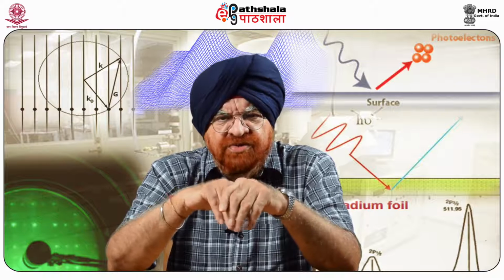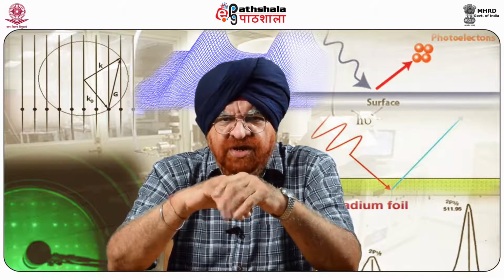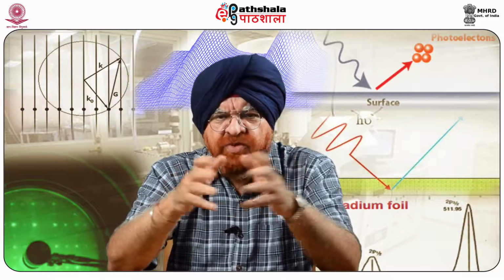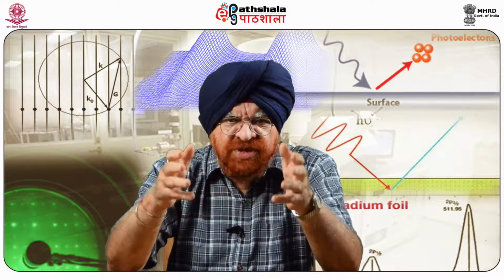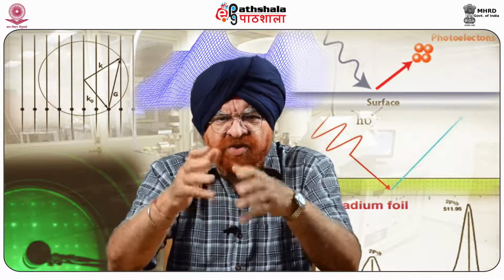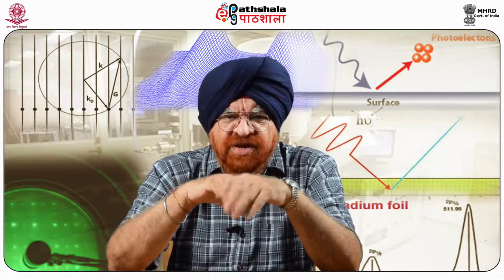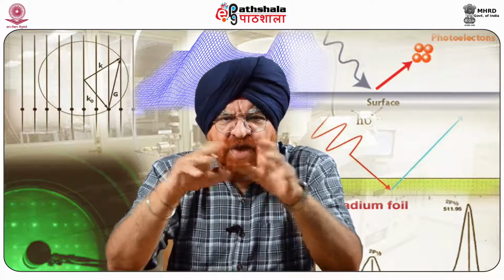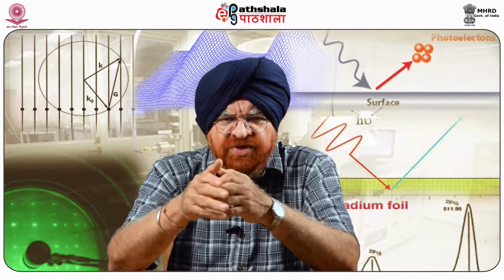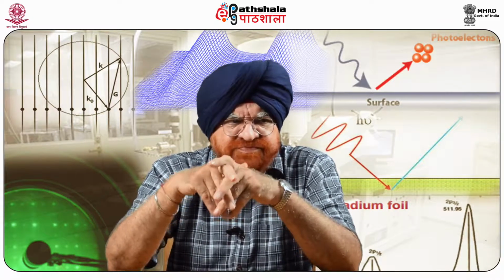Other researchers abandoned their attempts to image biological materials directly after finding it very difficult to obtain reproducible results. Because, as I said, biological materials have very large molecules, and to get reproducible results, one was finding it very difficult. It is unclear what the mechanism of the electron transport is through these materials, which obviously one has to study with the help of STM.